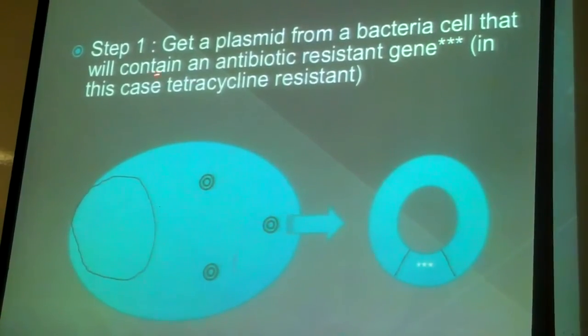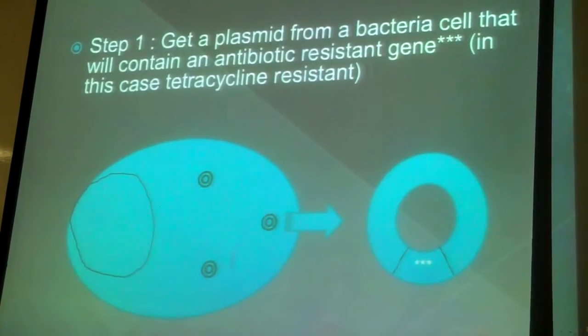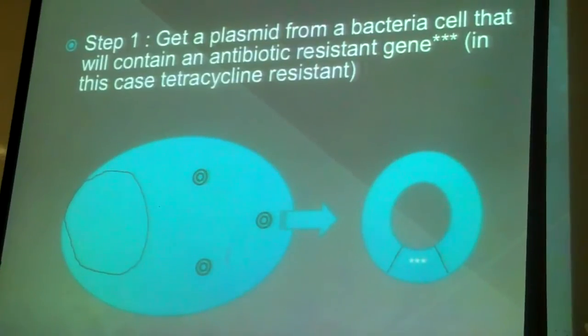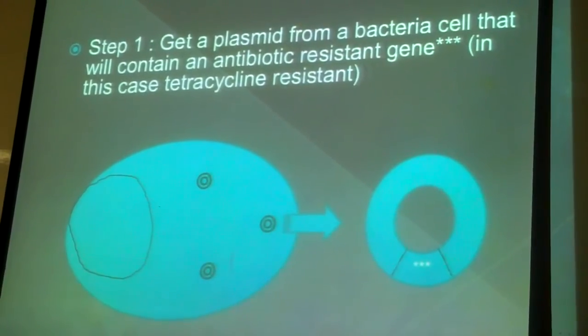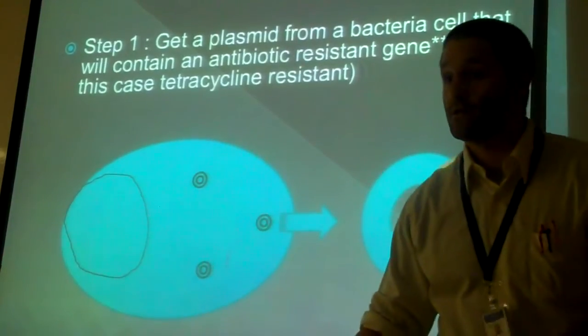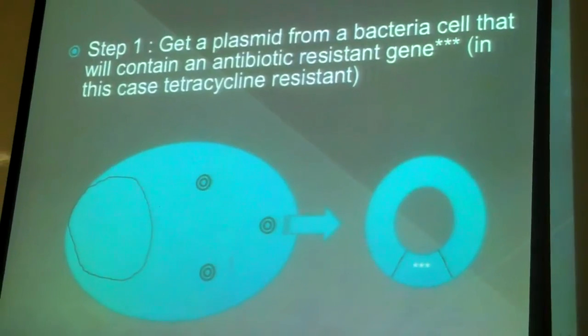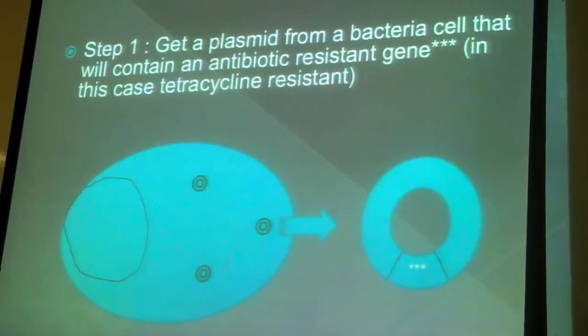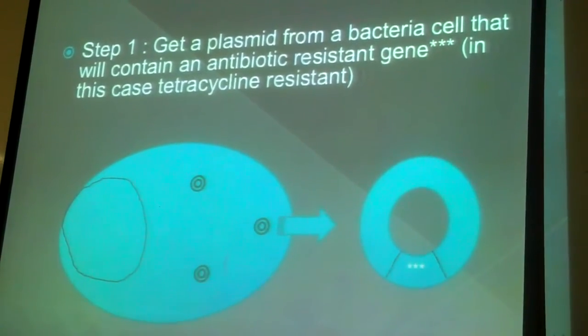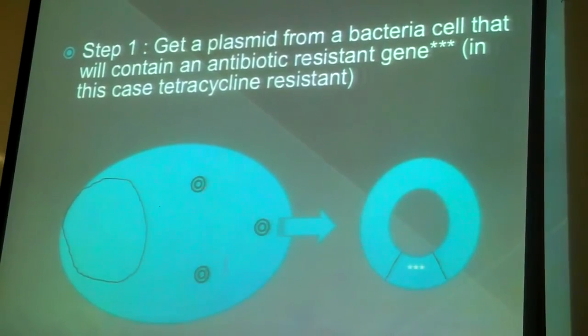And we're going to get something with an antibiotic resistant gene. What does antibiotic mean? Does anybody know? Antibiotic. It's resistant to biotics. What's a biotic? Yeah, you're right. Resistant to living things. It kills bacteria. Antibiotic. Bacteria killer. Everybody hear that? You said it, and we got it, so we're good.